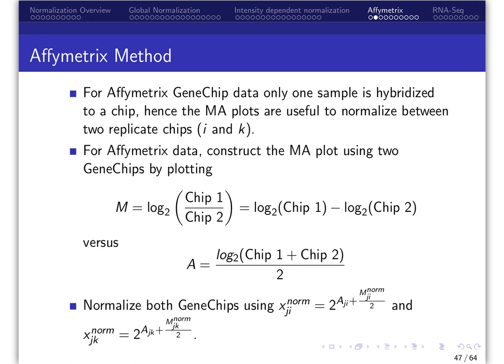custom spotted arrays. However, since we would like to analyze the data using the normalized probe intensities per gene chip, rather than the normalized log ratio of intensities for a pair of gene chips, the normalized chip intensities are given by these equations, for probes j on gene chips i and k. Again, this adjustment is apportioned equally to both arrays when considering the correction on the original scale.